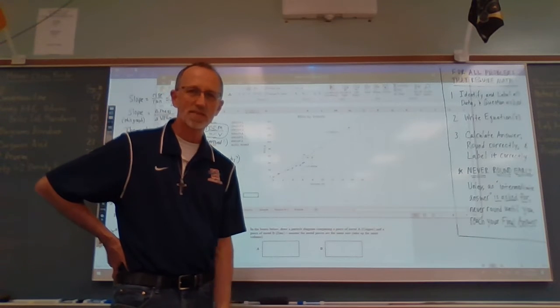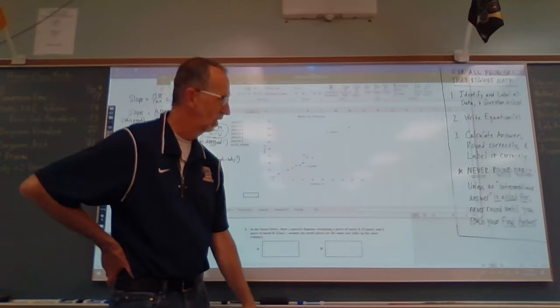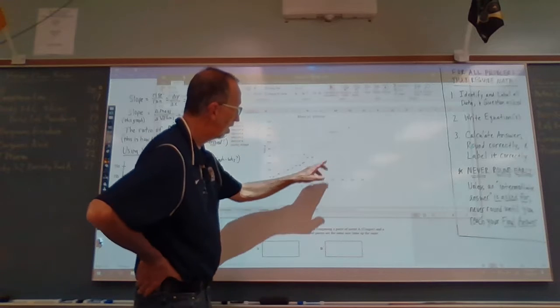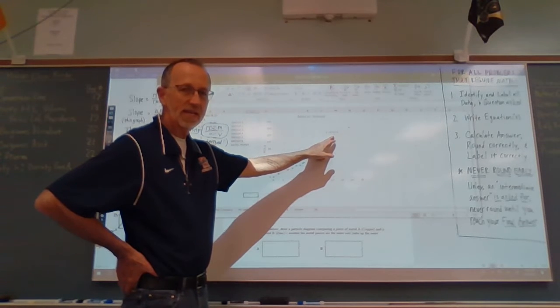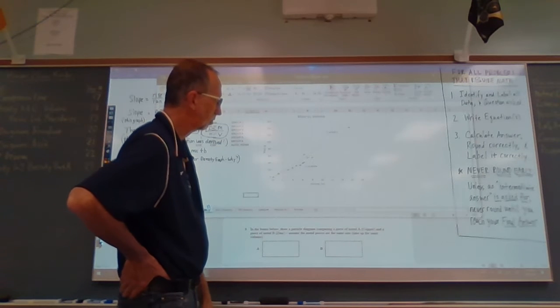Excel, of course, has a brain far beyond me, and so it draws a much better line. And what we have seen here also is it is giving the slope-intercept equation for each line.